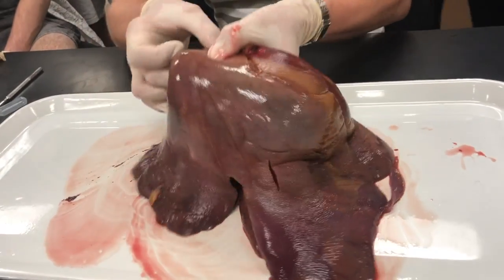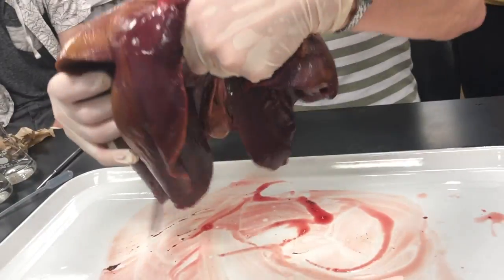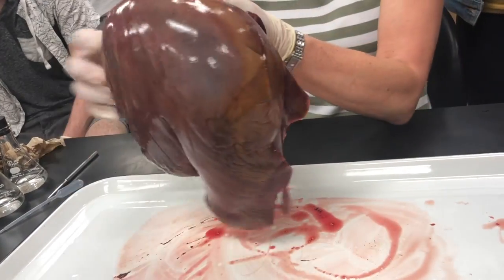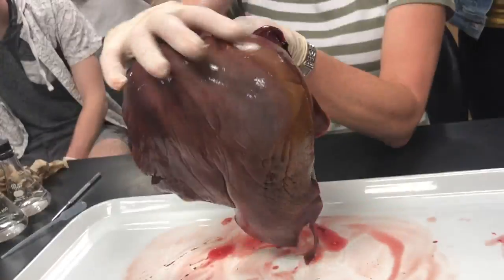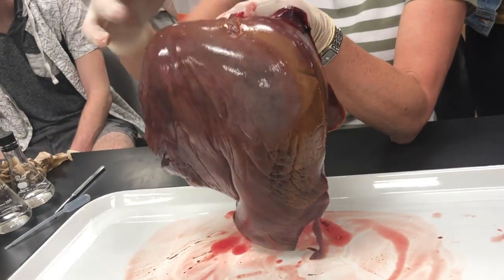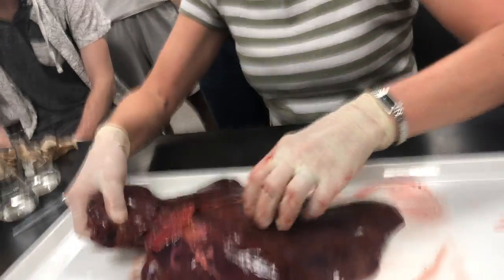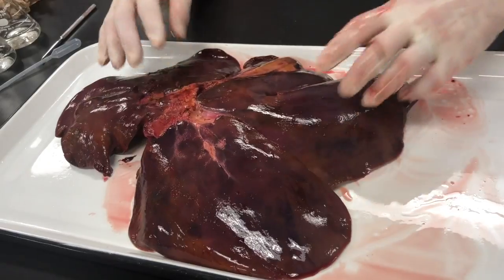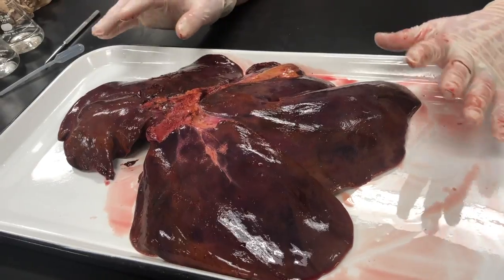Put this in the pig's body, it would sort of hang like this if the pig was standing on its back feet. So that would look sort of like how ours looks, all right? So this would be anterior or superior on the pig. And then this surface where the more interesting looking stuff is, this is going to be the inferior or posterior section of the liver.